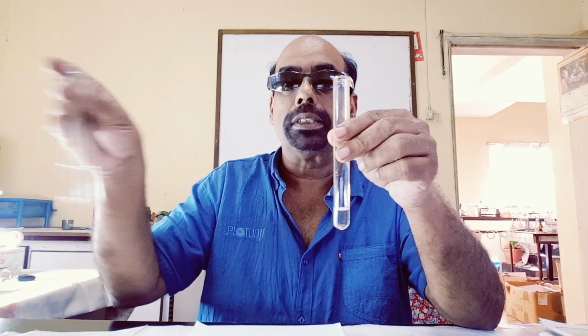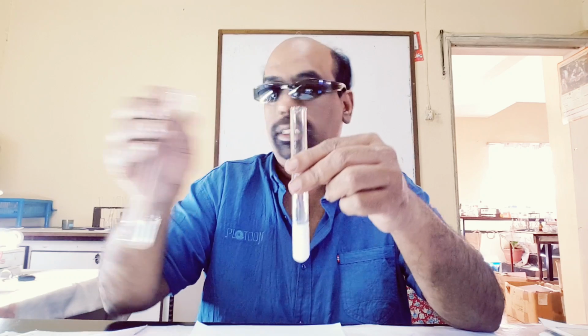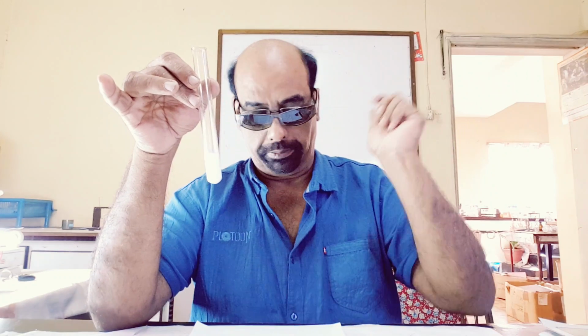So here, to sodium sulfate, I add barium nitrate, and an immediate white precipitate is formed. I want to get the barium sulfate from the mixture of barium sulfate and sodium nitrate solution.